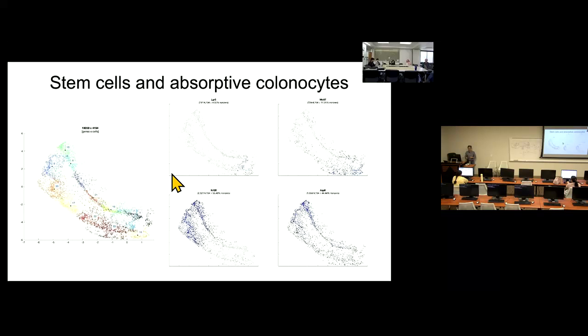We try to make this ChatGPT-like stuff to automate everything, and there's something we are working on actively. But still, this is like a typical procedure. I hope you can learn from what Michael is talking about, how you are going to deal with individual clusters of cell.